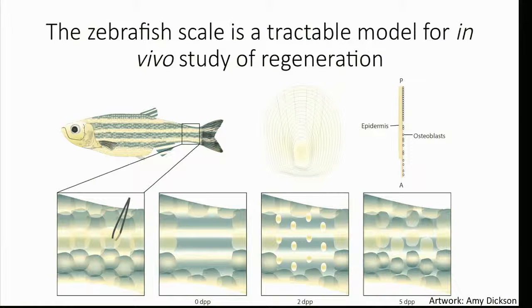So the take home is that if we want to look at regeneration happening rather quickly, there's a window of just a few days where we see massive growth and can get a window into regeneration occurring on a relatively short time scale.